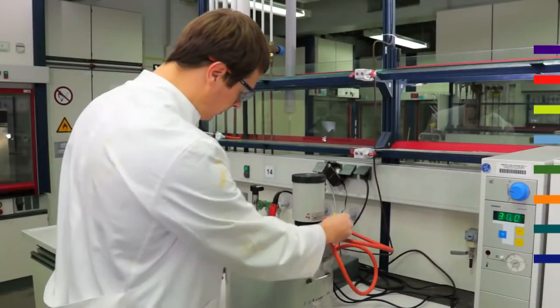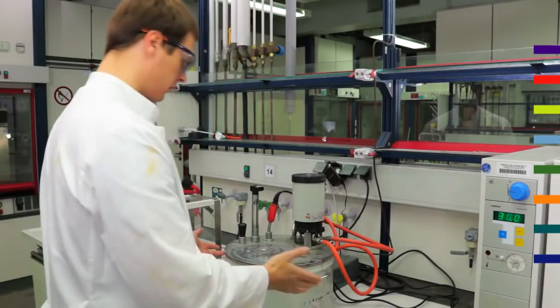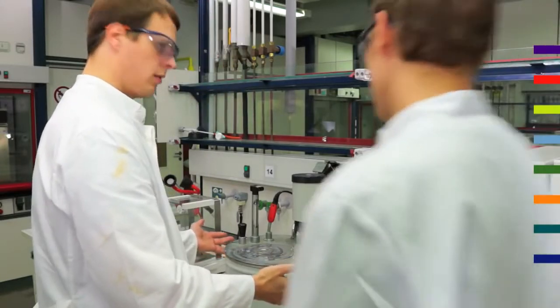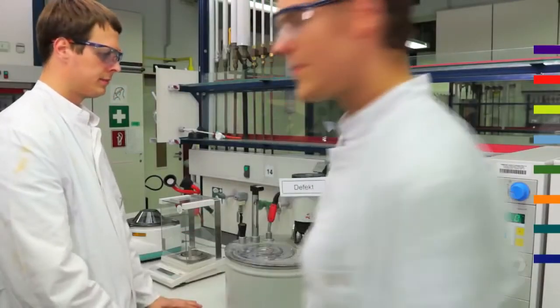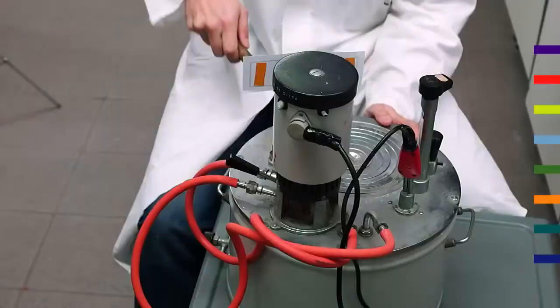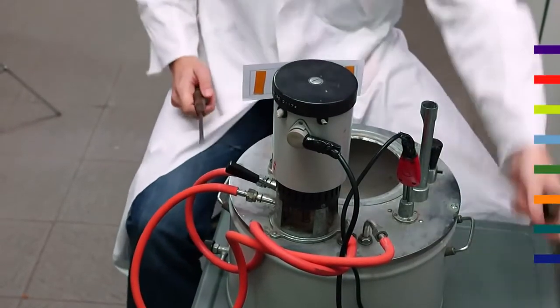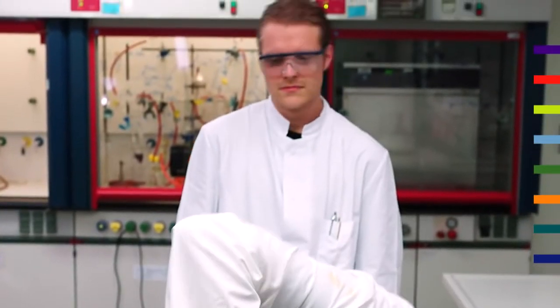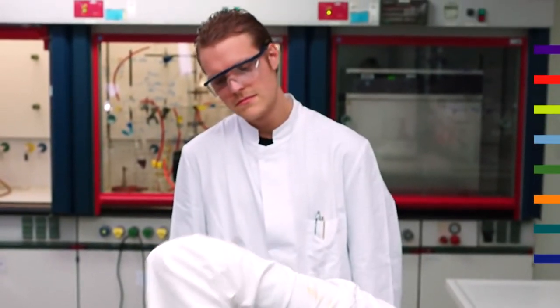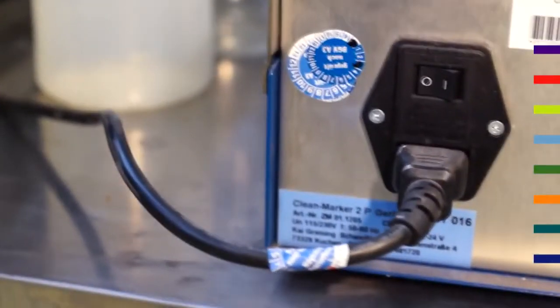If there is damage or malfunction, the apparatus must be switched off and a qualified electrician must be notified. It is not allowed to continue using damaged equipment and the dangers must be signposted. Repair work by unqualified electricians is prohibited. Repairs of electrical facilities and equipment may only be performed by qualified electricians. Electronic equipment in the laboratory must be tested regularly.